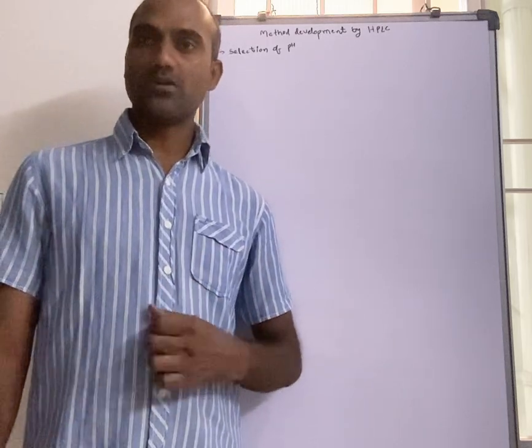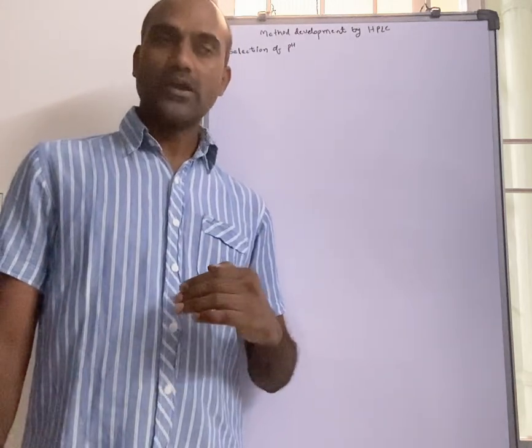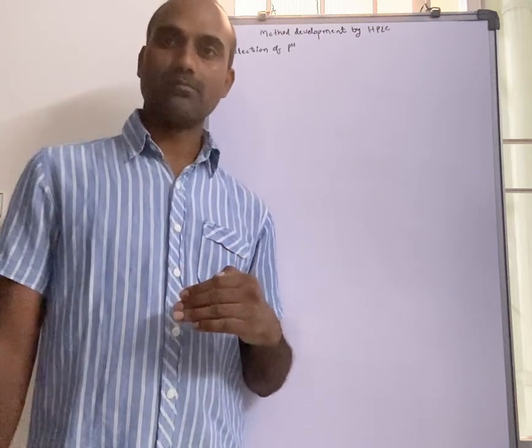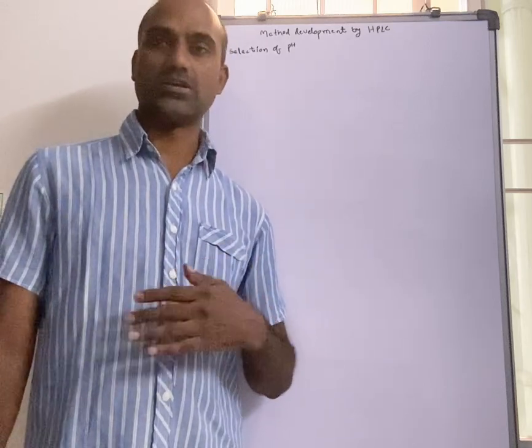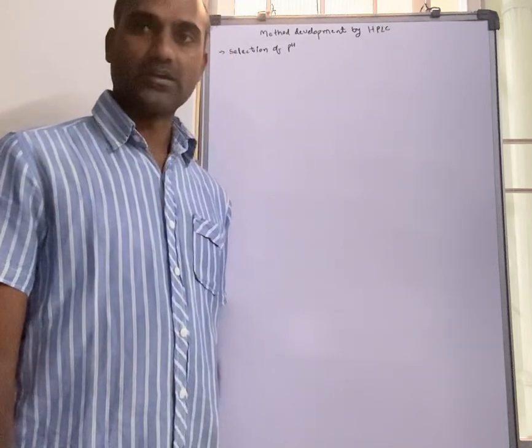If any acidic molecule is there, then that molecule will not dissociate in acidic environment, so it is in the unionized form. Not dissociated means unionized, which means non-polar or hydrophobic in nature. By this non-polar nature, the compound retention will increase.